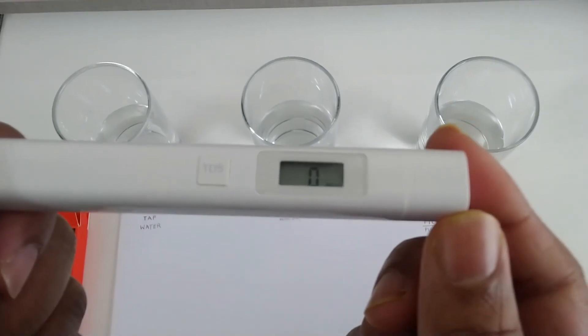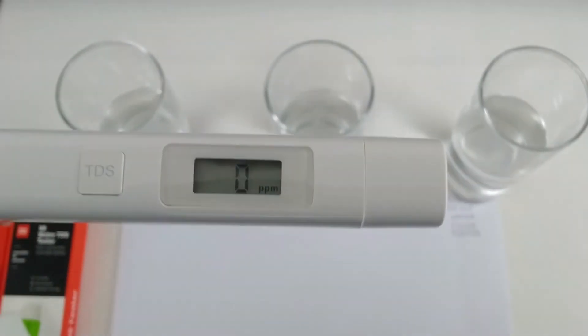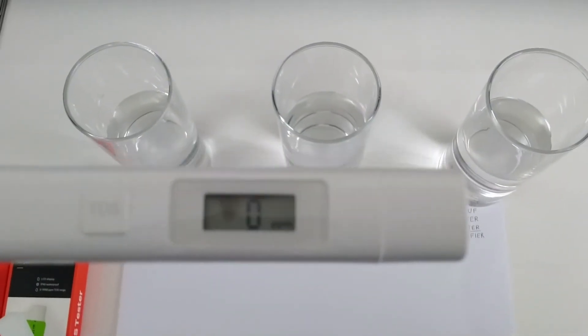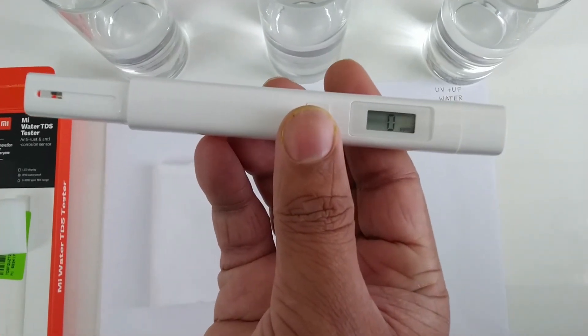You can see it's showing 0 ppm. This is the on/off switch — as you can see it turns on.